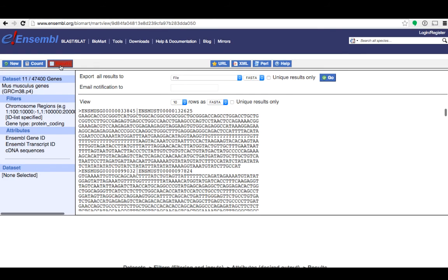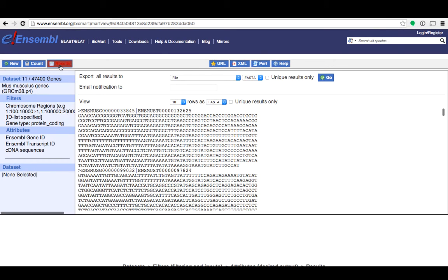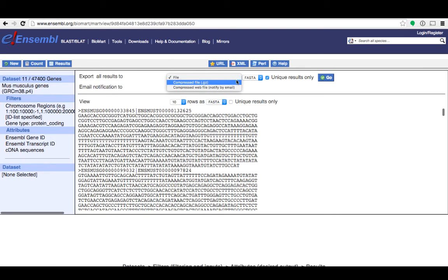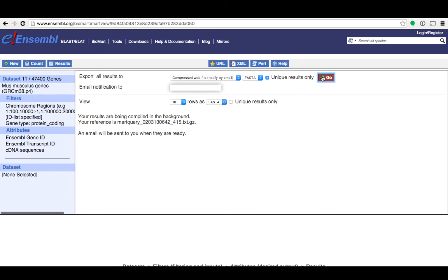Again the results page is just showing as a preview but we wanted to download a file this time so I'll show you how to do that. First I'm going to click unique results only. You also have the option to download a compressed file or a compressed web file which will notify you by email when it's ready to be downloaded. I'll choose that option. I'll need to put my email address in this box here and then click go. I'll receive an email when my sequences file is ready.